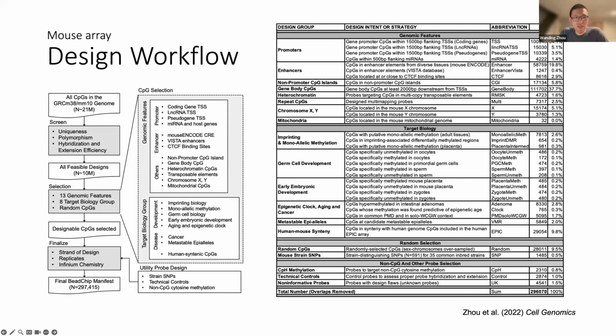So this is considered a genome-wide assay instead of, for example, an early development embryo assay. But I think there are some custom arrays. I should probably ask Illumina more directly. I think Varun also knows that better. You can custom make some arrays for just, for example, imprinting biology. Okay, thank you so much.